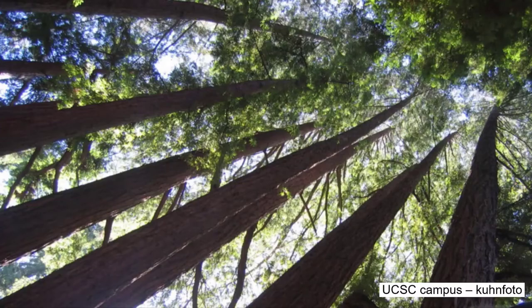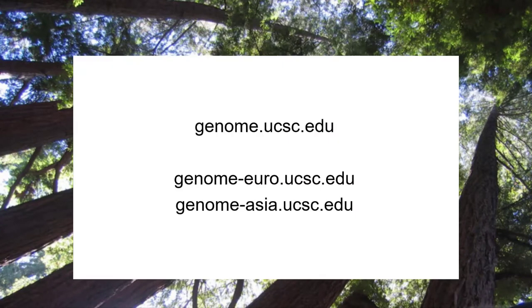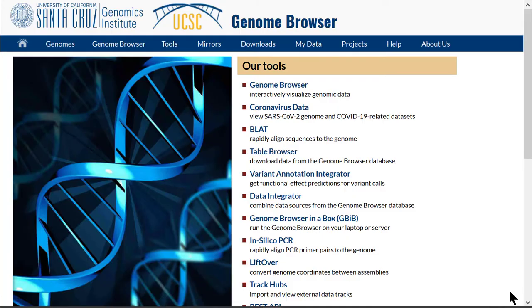Today we will focus on making URLs on the fly. These URLs are distinct from saved sessions in several ways, but typically they are additive, allowing whatever tracks are already on in the browser to remain on, simply adding to them as defined in the URL. We will also show you a parameter that defeats this tendency: hide tracks.